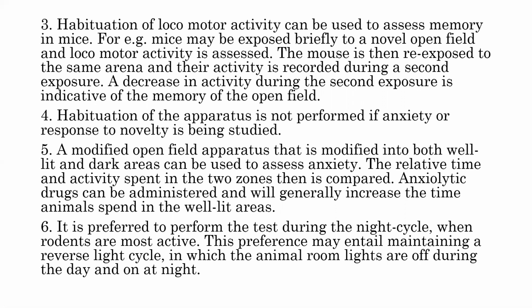Number 4, habituation to the apparatus is not performed if anxiety or response to novelty is being studied. Obviously, if you want to check the anxiety level of the mouse, how much anxiety it is going to show when exposed to the activity cage, habituation is not preferred.